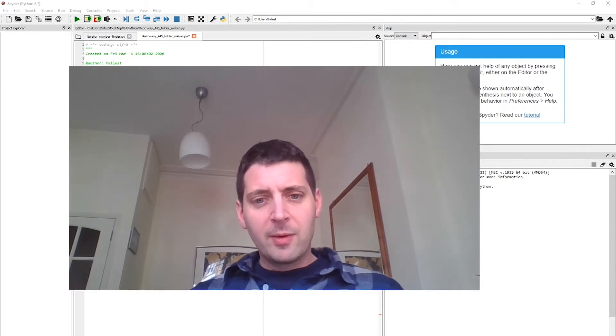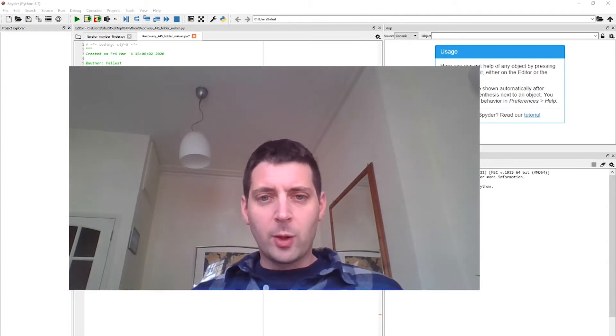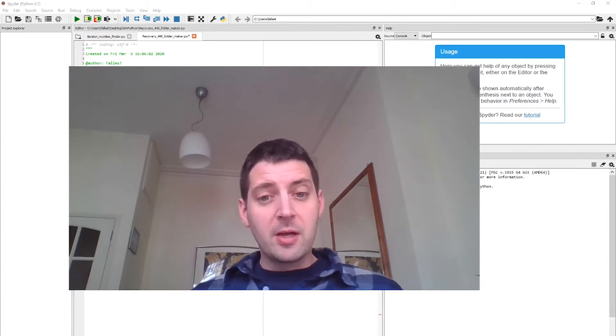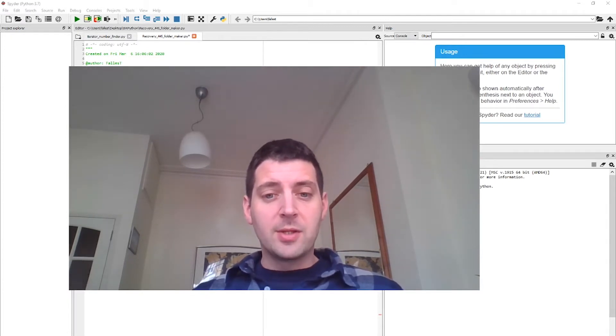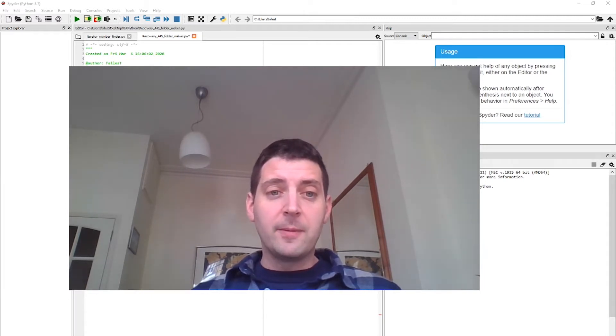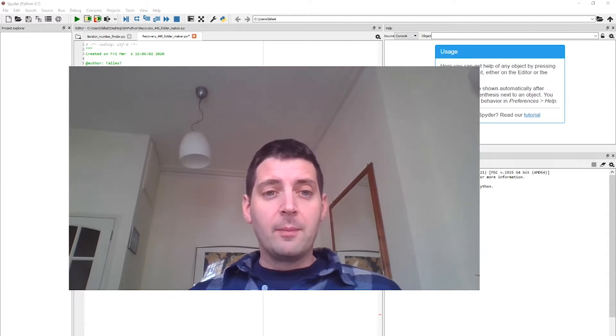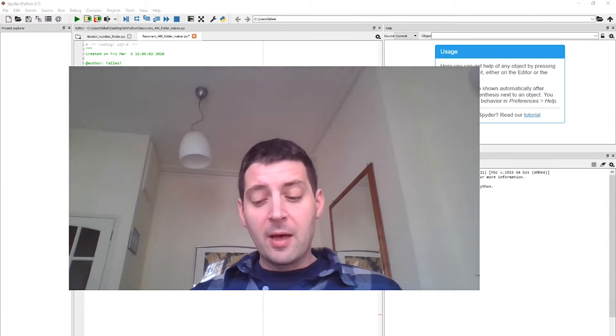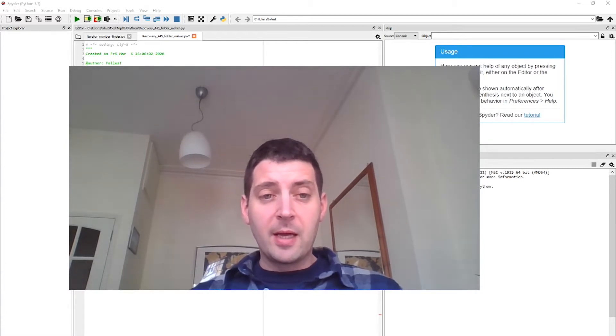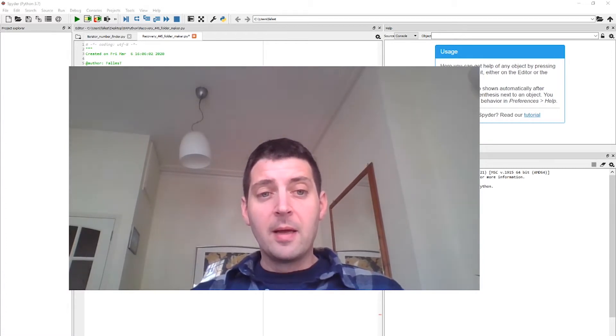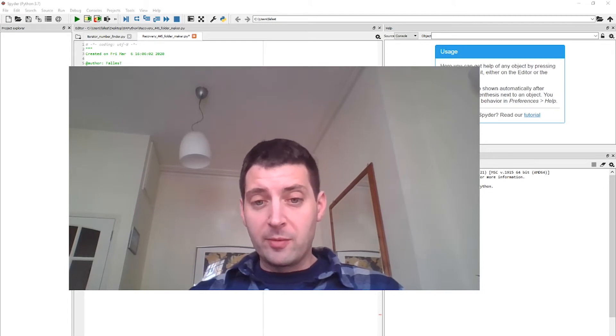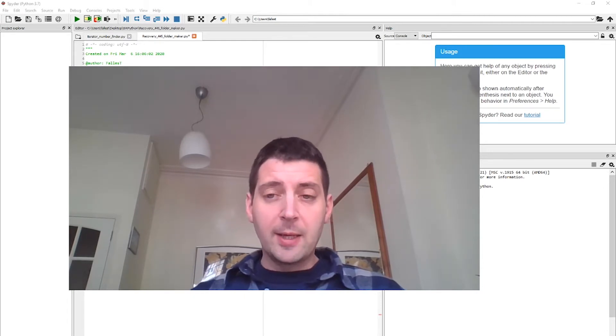In this module, we're going to be working to integrate workflows between Python, Fiji, and Jython, which is an implementation of Python that's used inside of Fiji. In Python, we're going to be using Jupyter Notebooks, and you should have installed Pandas, NumPy, and Scikit-Image in your Jupyter Notebooks, hopefully from a previous module already.